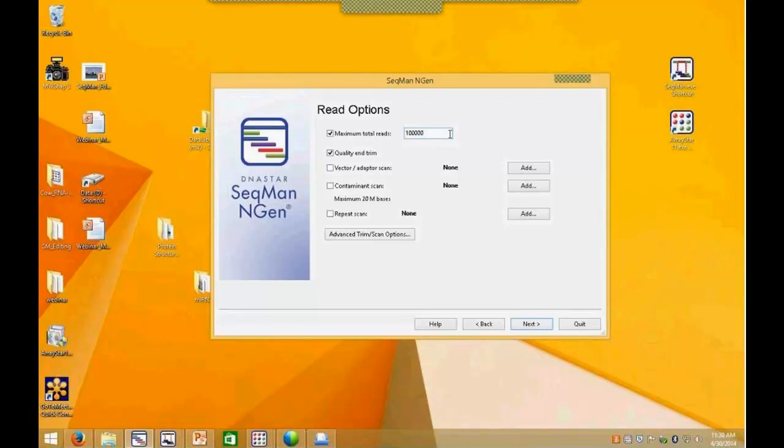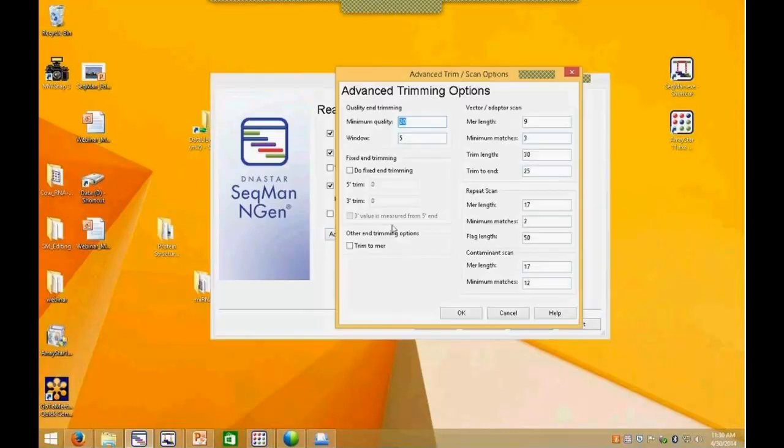So I would scale this back and just stick with, I wouldn't worry about scanning too much, but we might come back to this. I'll do this pilot run of 100,000 reads, and if I see that there's a lot of ribosomal RNA, maybe I set up those ribosomal RNA sequences as contaminants and pull them out. And so you might clean up the data by doing a pilot and use these contaminant scans to pull out some of the noise to help the de novo assembly. And again, there's all different other scans we can do.